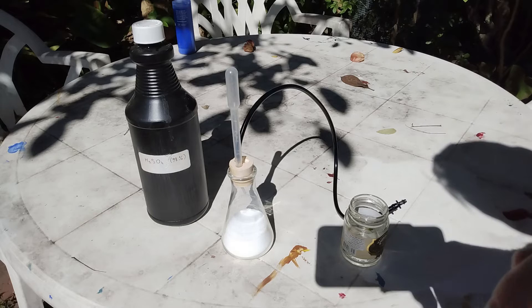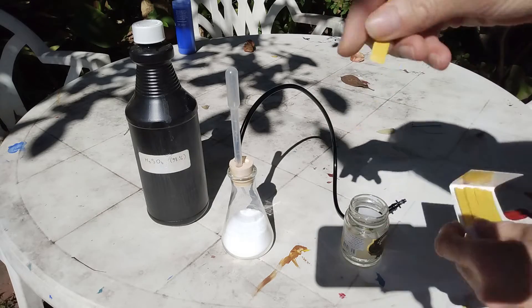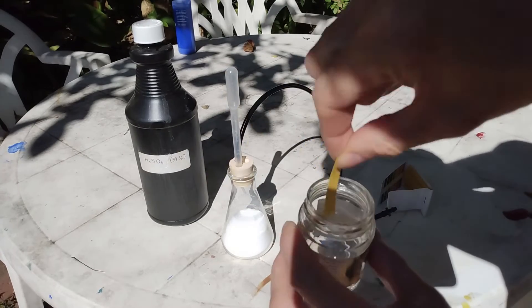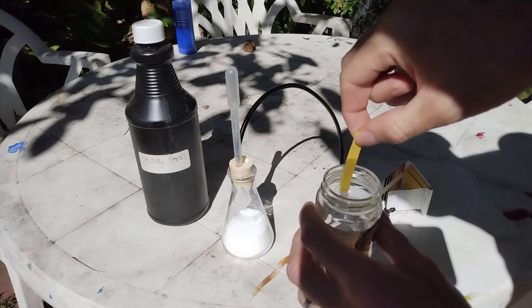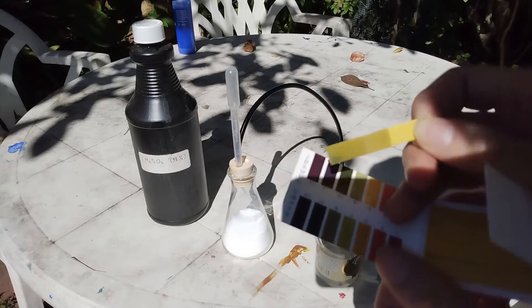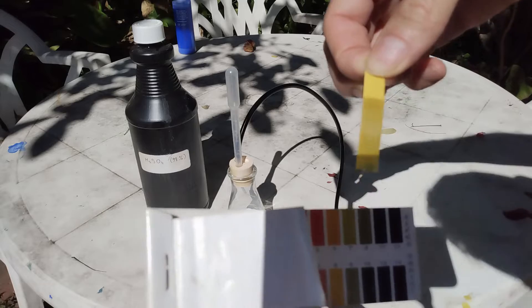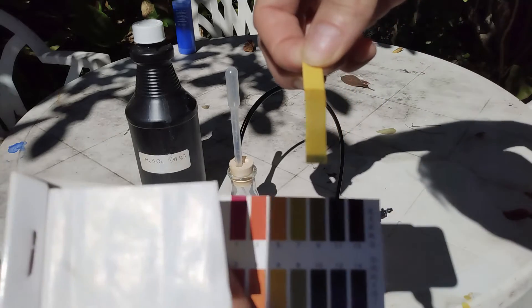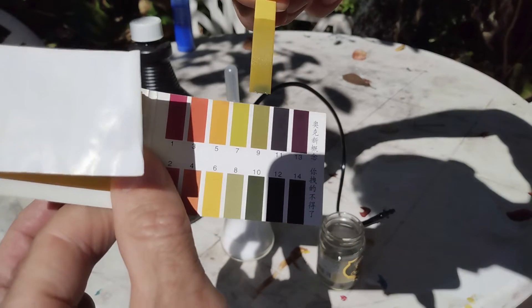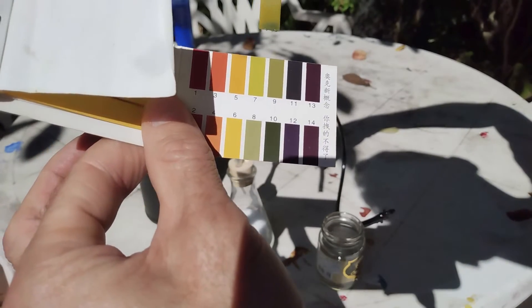Now let us just check that what we have right now is just water. That doesn't prove that it's water, but at least it proves that the pH is 7. I can't actually see the screen of my phone — I'm using my phone as a camera — but the pH is 7.